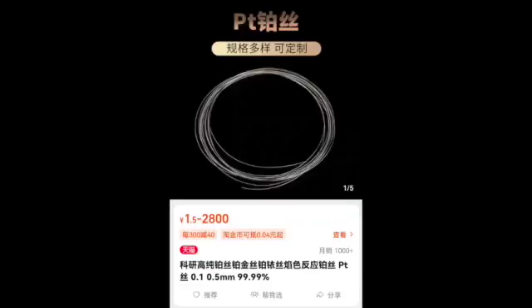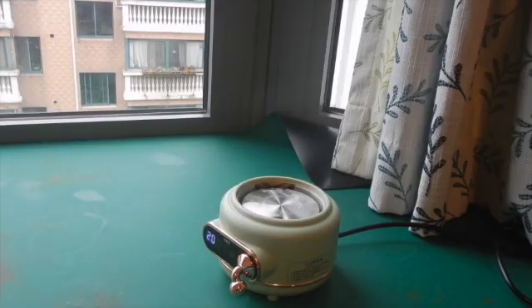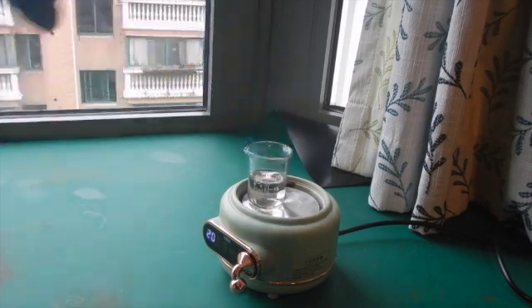The platinum that I used here was a platinum wire that I bought online for a dollar. The platinum will slowly dissolve into the solution, but the reaction is very slow at room temperature. Therefore, we need to heat it up on a hot plate.